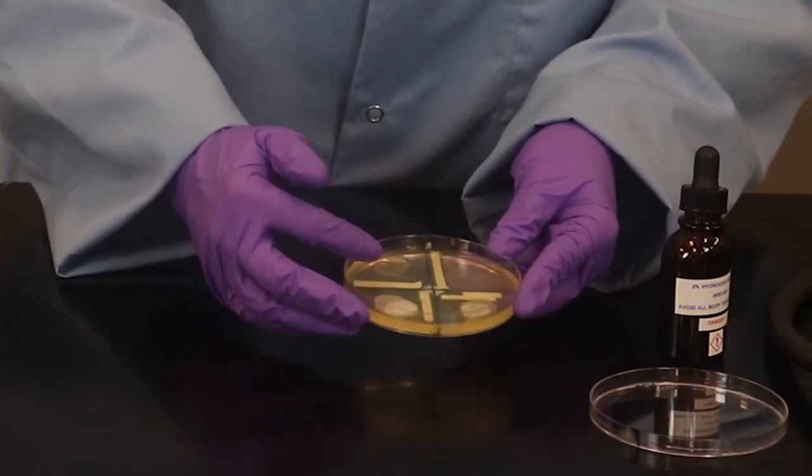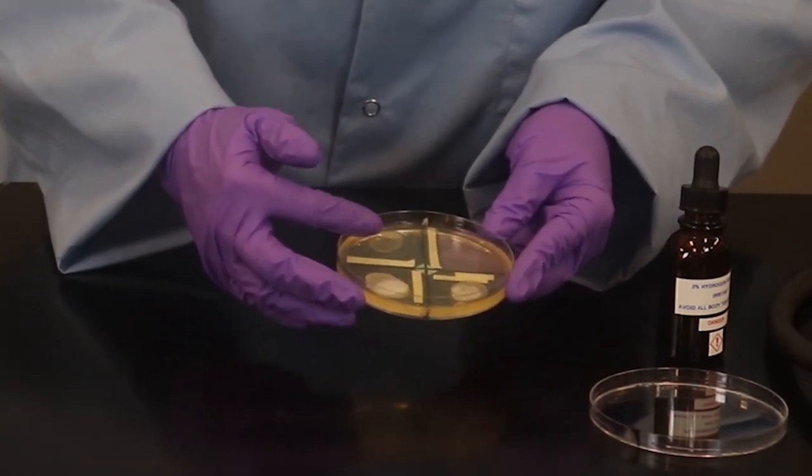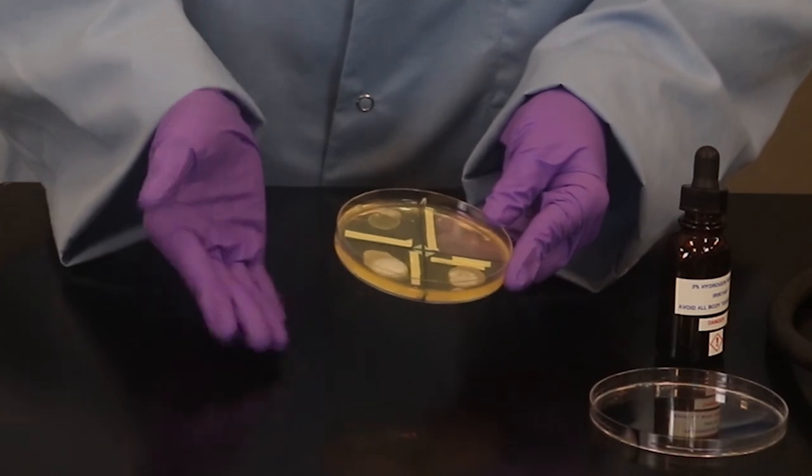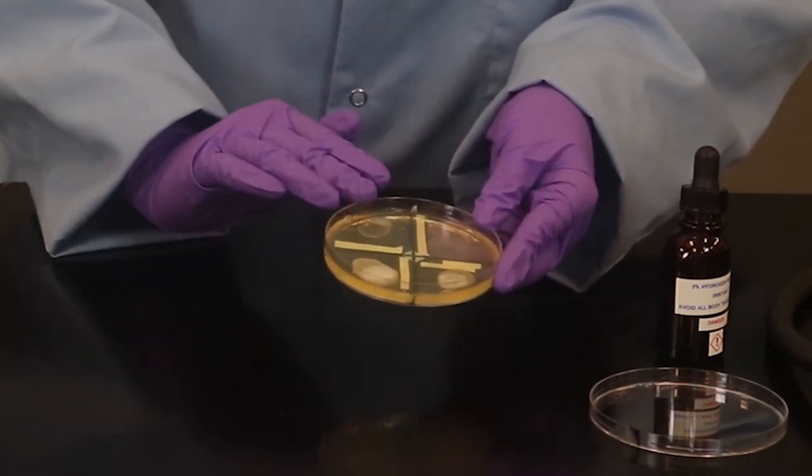And I'm really not getting significant bubbling, especially where I have the most growth here. It's kind of hard to see. Interestingly, Lactococcus can grow aerobically, but we don't see catalase.